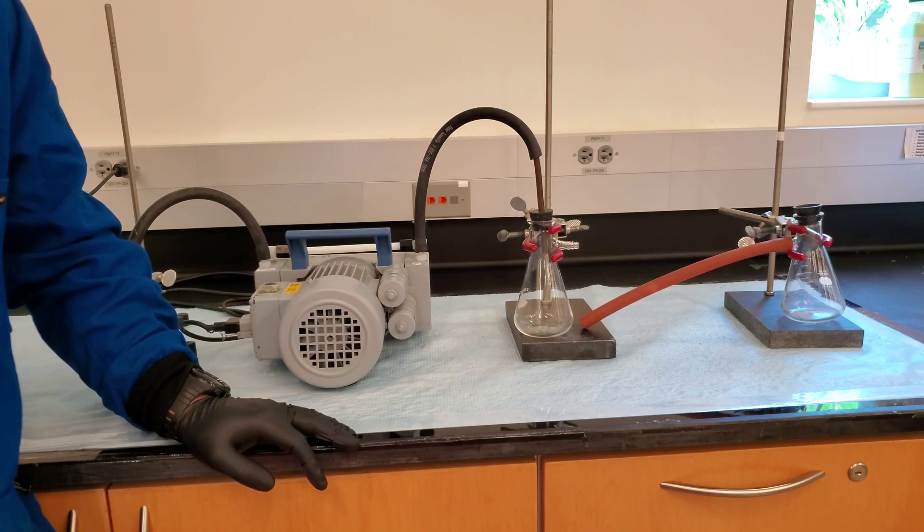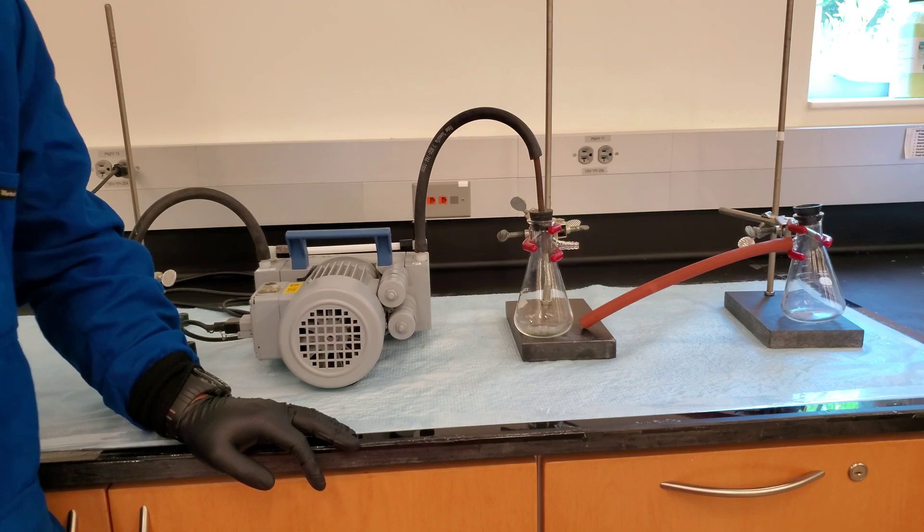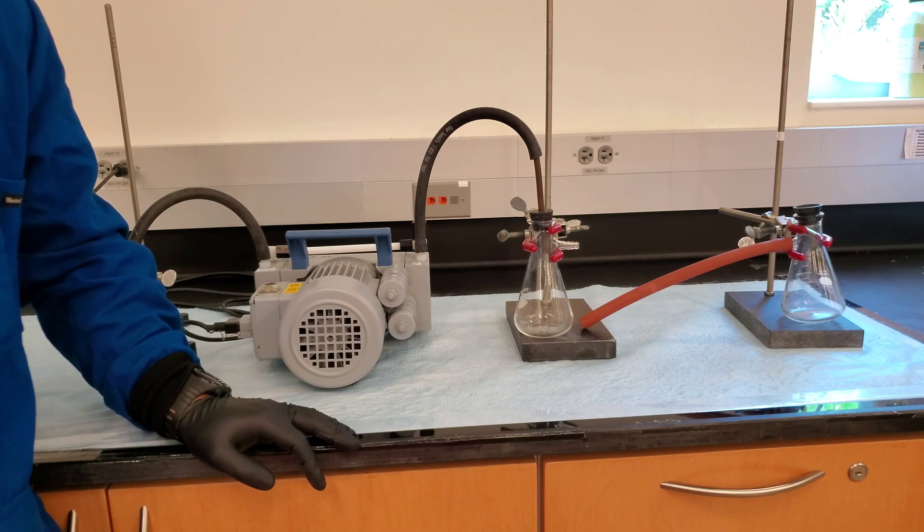We'll be going over how to properly use a vacuum pump. The vacuum pump is used for vacuum filtration or vacuum evaporation. Whenever we use a vacuum pump, we always need to make sure we use a vacuum trap. A vacuum trap is used to trap toxic or corrosive chemicals and vapors to protect the vacuum pump.